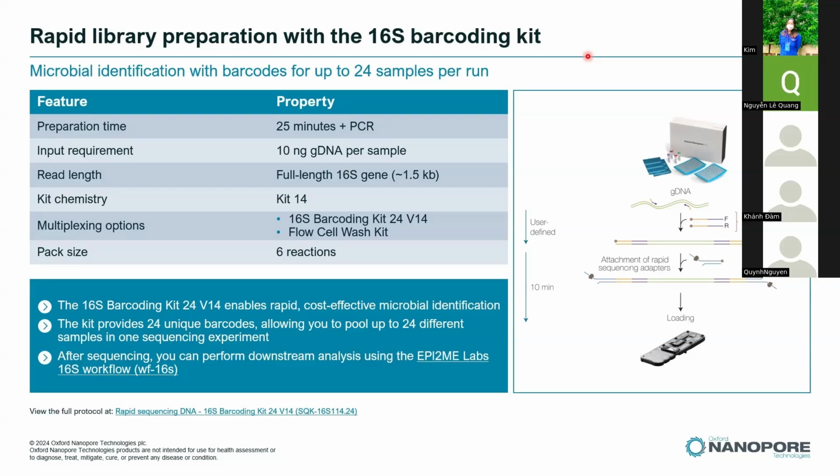So in this case, whole genome sequencing or sequencing of additional genetic regions, like for example the ITS regions, will be very helpful for more precise species level identification. But however, if you want to do 16S sequencing, we have these available.